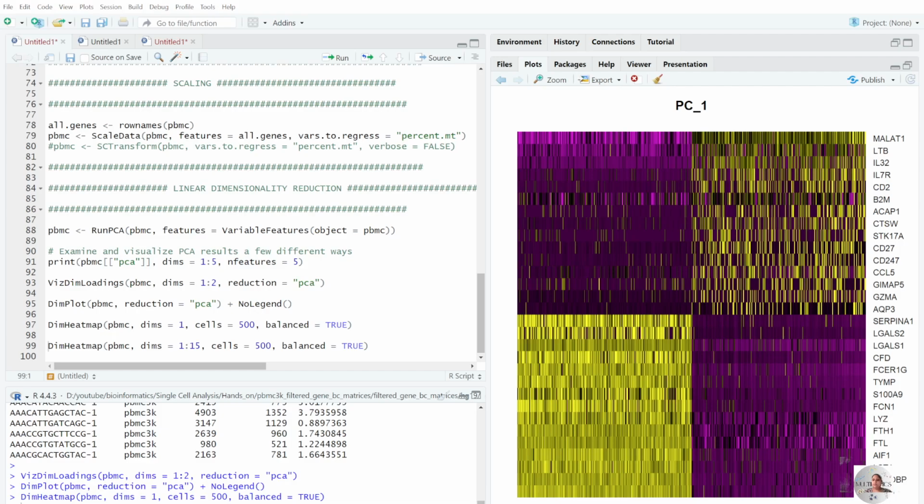The yellow zone genes, which I've told you now, usually if you go and perform some literature search, you'll get that these are the marker genes for monocytes or macrophages, right? And the other genes, AIF1 and FTL, which are highly expressed. So where is FTL? AIF1 here. AIF1 and FTL, so they are together over here. They are the markers for inflammatory response genes, and they are highly expressed. It is also showing that they are of myeloid lineage. Okay, so they may be monocytes. So these insights you will get if we go on for further literature search.